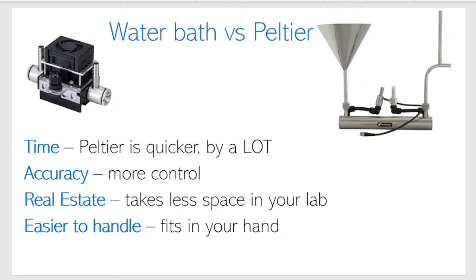The flow cells tend to be a little clumsy because of the shape, as you can see to the right. They can be a little heavy depending on the material. And yeah, it can also be a little bit expensive. And if you're looking for a specific material, let's say most of them are made from stainless steel, but if you're dealing with some acids or some materials that are corrosive or react with stainless steel, then getting the flow cell in a specialized material might be more difficult.